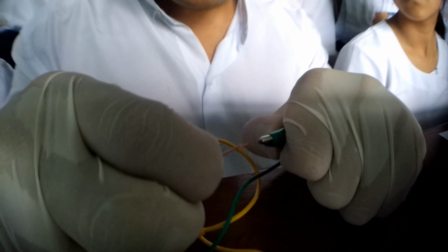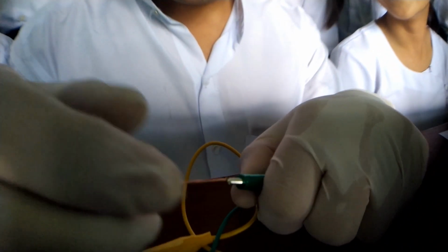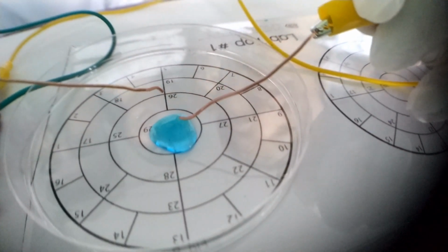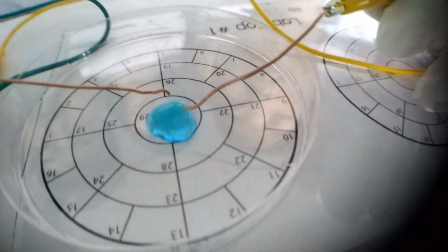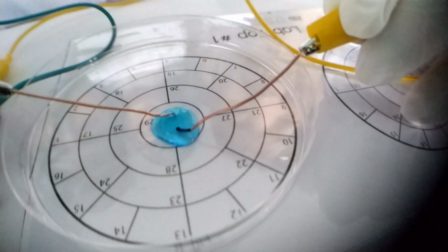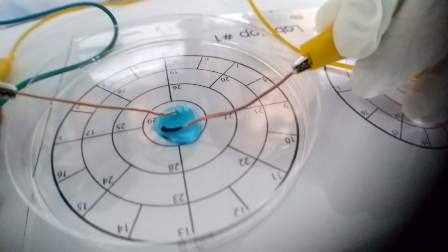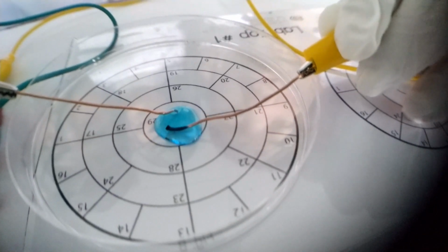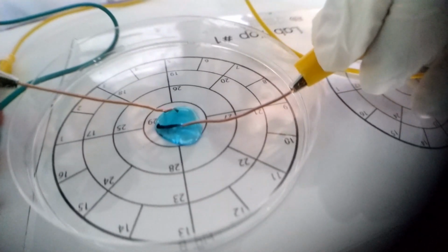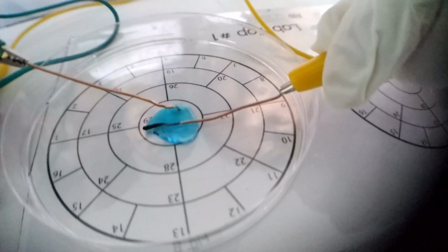Now, clip each of the alligator clips to the positive and negative terminals of the 9-volt battery. Clip one of the pieces of copper wire to the other end of each alligator clip, one clip at the positive terminal and the other at the negative terminal. Now, the tips of the copper wire pieces are partly immersed into the solution slowly and with full care. That is, be careful not to let them touch each other. Leave them in the solution for 2 minutes.